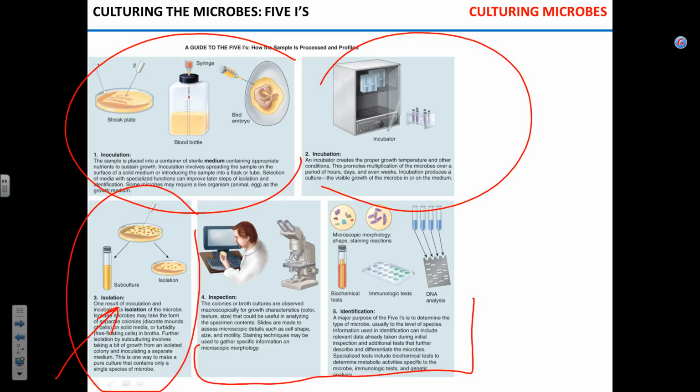As I mentioned, you're going to swab things, like whatever you want. Your cell phone, your purse. I don't really recommend the bottom of the shoe. It's just a lot of microbes. It's really a lawn of microbes and fungi growing all over the place. It's fun to see, but you can't really isolate the single organism. You can swab anything you want.